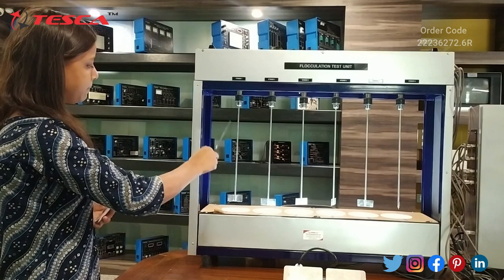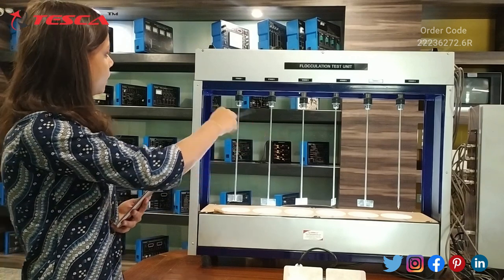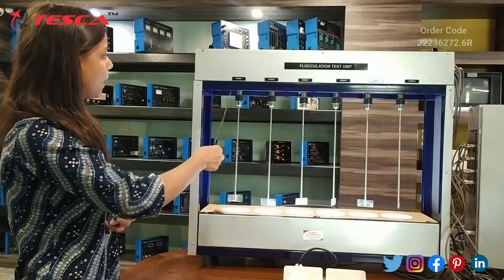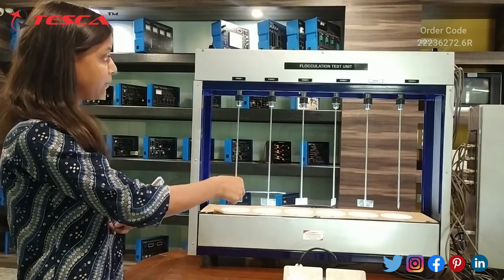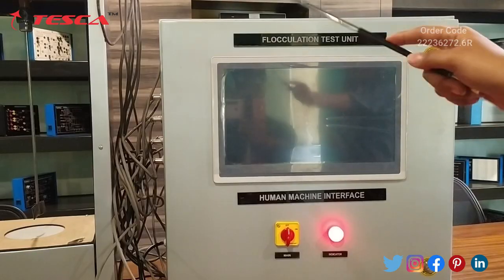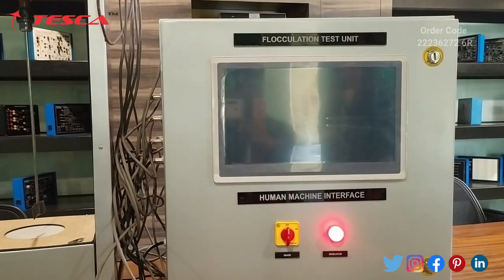This is our main unit. You can see there are six stirrers where we can place one-liter beakers, and a total of six stepper motors are there. We can control the RPM of each motor individually by the control unit, and we can also control the timer of each motor individually by the control unit, or we can say the human machine interface.